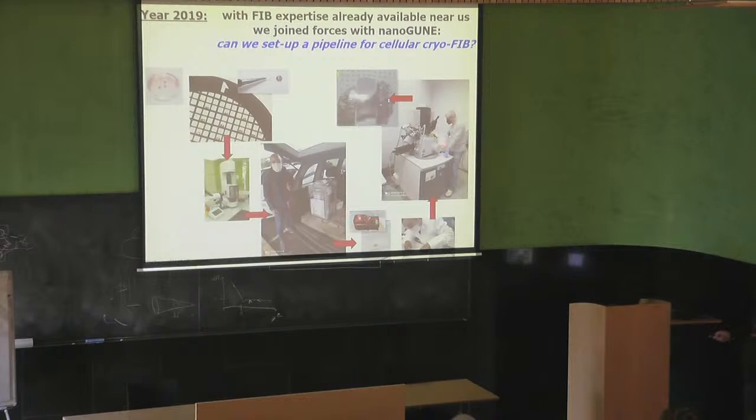They did also a shuttle. The transfer shuttle is important because it's the machine that takes our little grids from the outside world to the inside of the CryoFIB. And I had to put a picture of myself doing something because otherwise I would not appear anywhere, and to show that I do something sometimes, not most of the time. And actually I failed, and then I asked Eugene or Juan Diego to do it. But I won't put those slides.